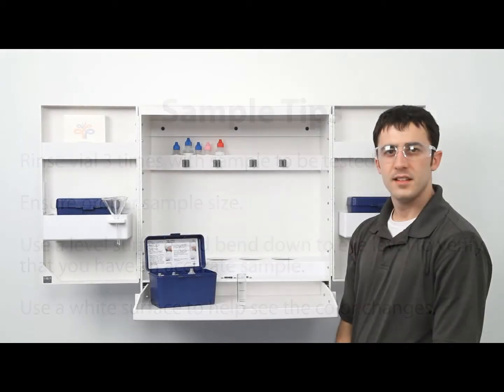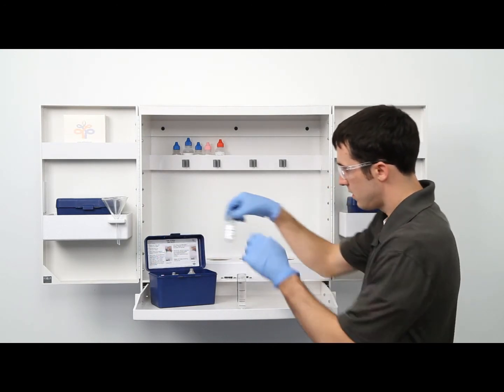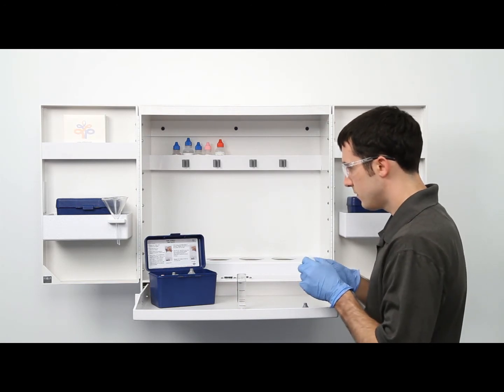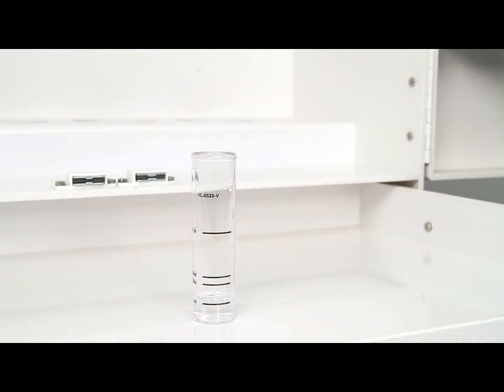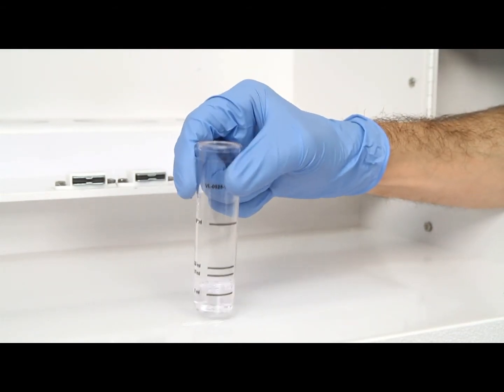Once you have gathered an accurate sample, the next step according to the endpoint ID procedure is to add 2 drops of complexing reagent. The bottle contains a dropper tip, so it's important to hold the bottle vertically to get a consistent drop size. After the addition of each reagent, swirl the vial to make sure the reagents are properly mixed.